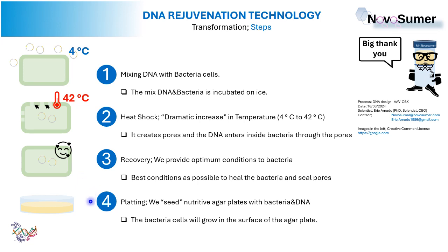And what about the fourth step? We plate. Whatever we have here, we plate into plates with a solid medium, a medium with agar. It's kind of a gel that is very nutritive. So the fourth step, as you can see here, is just plating.